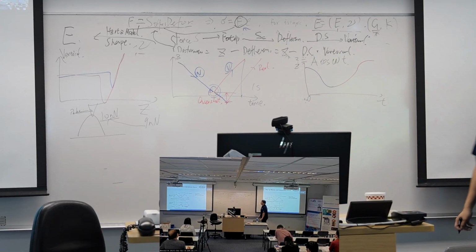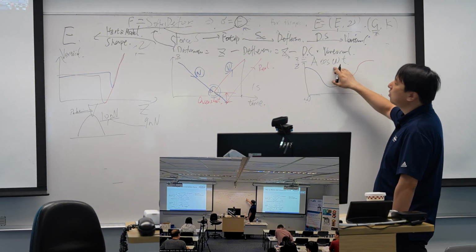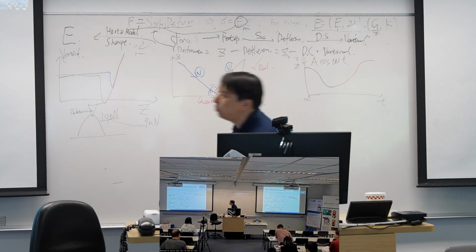Yeah, it should be something like that. I make up my movement like this: my z against the time is A times cosine omega t. I make it a sinusoidal movement.